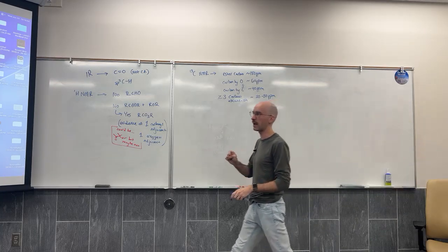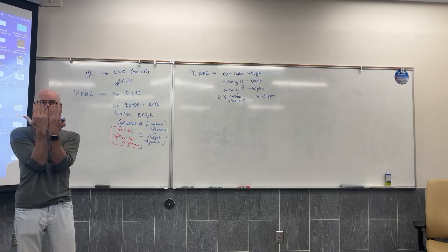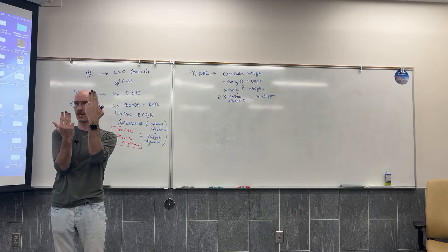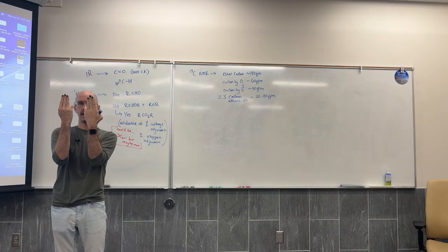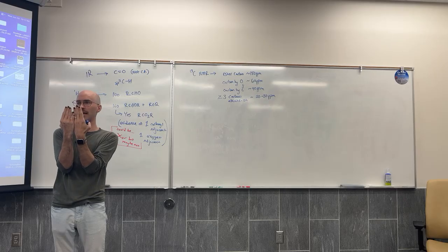The reason I think that is because of the proton NMR. I've got a 9H region, or at least that is the best that I could integrate this to. You can actually see that there looks to be multiple signals going on around 1 ppm, multiple signals that are just flush against each other and just barely overlapping. So instead of being able to get the integration of one set and the other, it seems like the integrations of both signals have just combined to look like 9H.